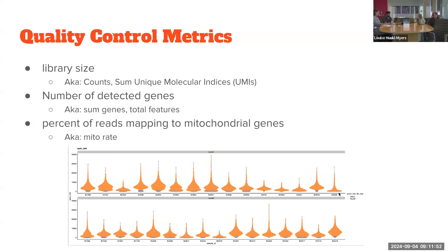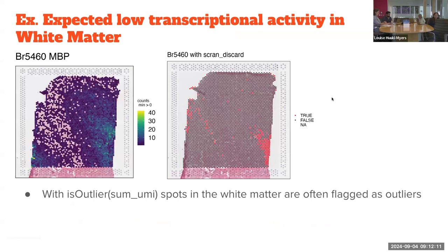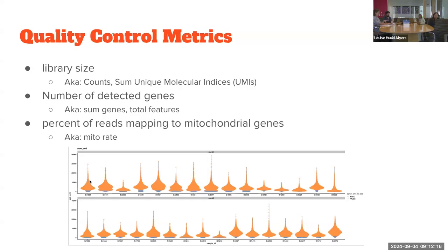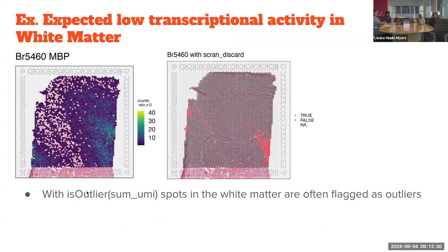Looking at sum of UMIs across a bunch of different Visium slides, almost all of them have some spots with very low UMIs. For single-nucleus data we'd just drop these bottom spots. We've typically used scran's isOutlier, which finds spots three MADs from the median — a sample-specific distribution cutoff that works pretty well for single-nucleus data. However, we're finding that it's pretty aggressive when it comes to spatial data.